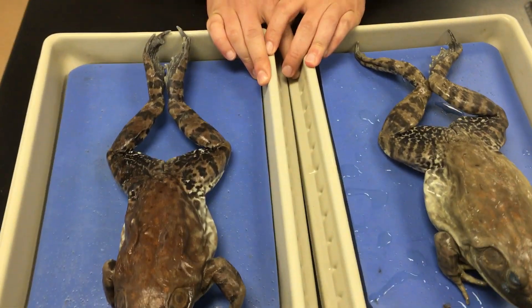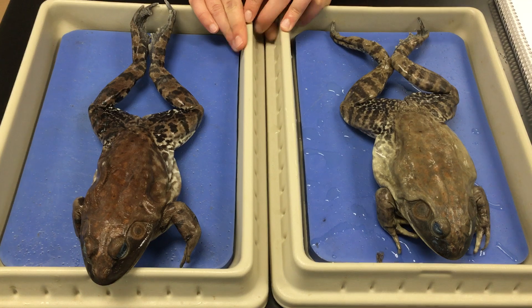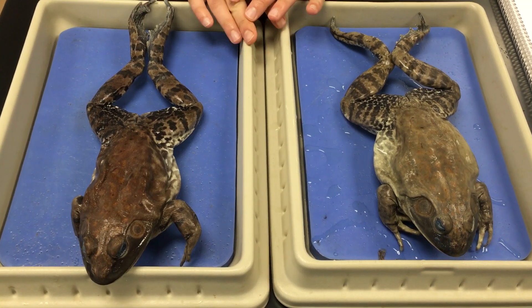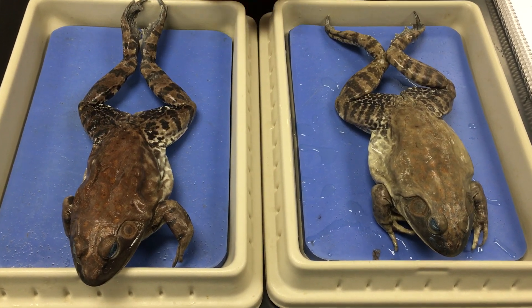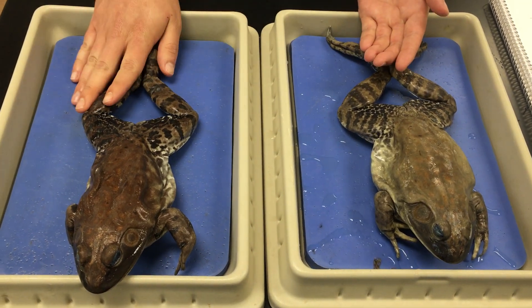What we have here are two American bullfrogs, Lithobates catesbeianus. The first thing I want to point out with the external anatomy is how to distinguish a male from a female. Here on the left we have a male and here on the right we have a female.